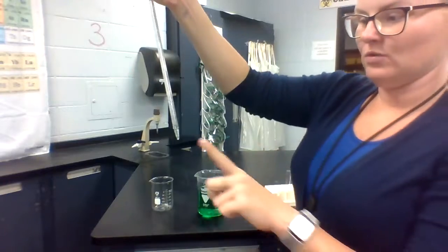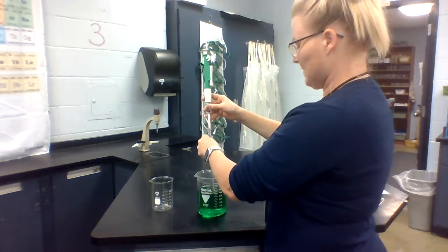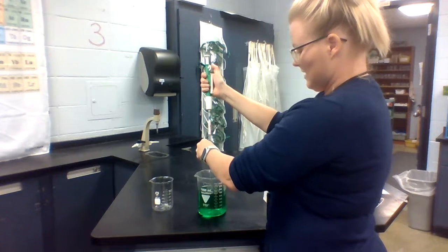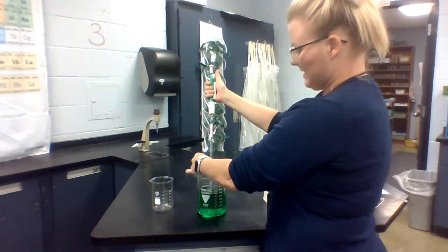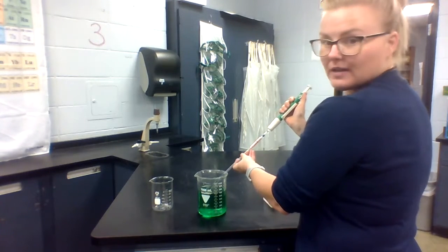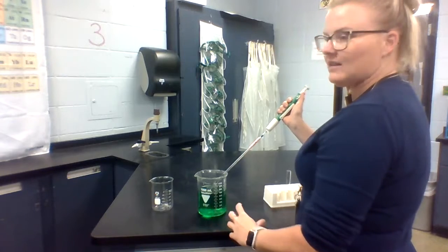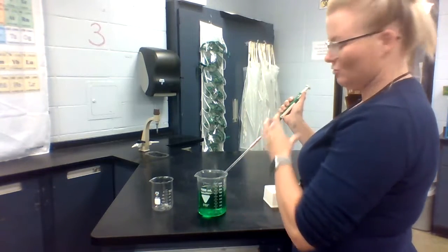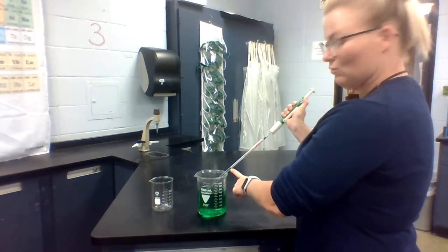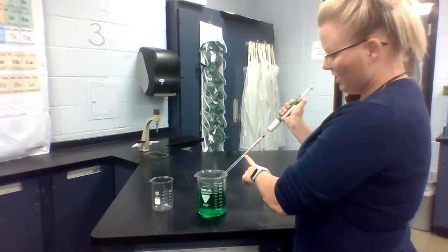So once you've got your calibrated liquid in there, go ahead and draw up to the zero line. It helps if you tilt the pipette a bit to the side so that it doesn't have to fight the full force of gravity to travel up into the tube. Lay it to the side just a little bit and then gently roll down on the pump until you come up to about the zero mark.